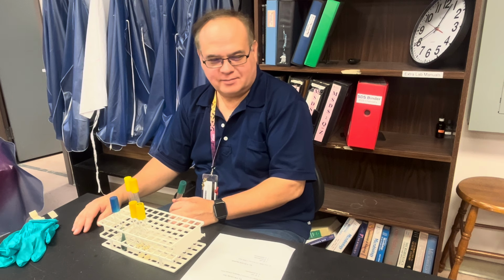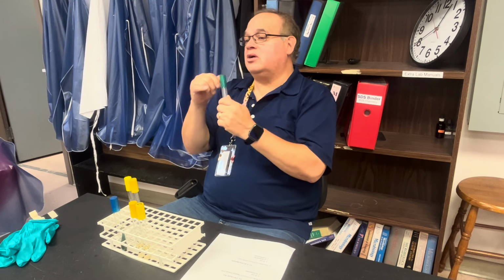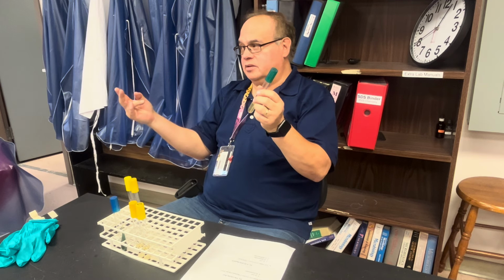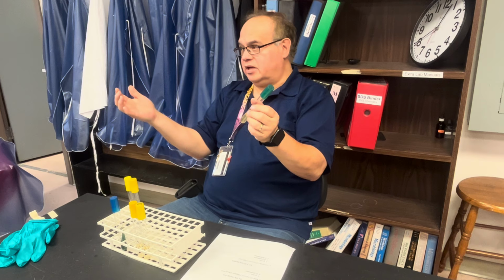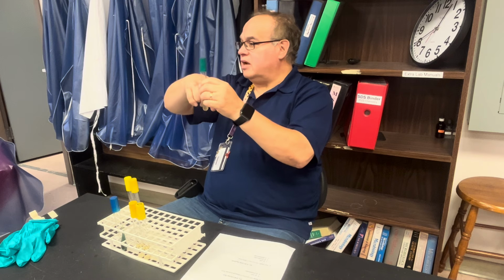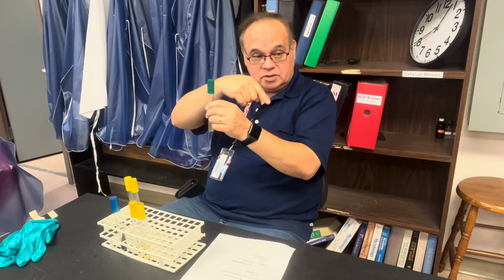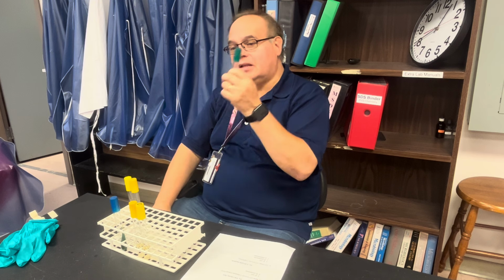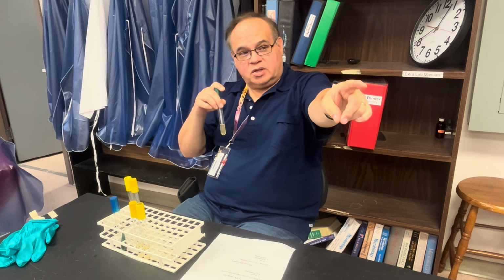You inoculate, you come back in 2 days, Thursday, and you can see those 2 things really quickly. If it's black, it's H2S positive. If it's not black, it's H2S negative. If it's only going to the site of inoculation, it's non-motile. If it's fuzzy away from the site of inoculation, it's motile. The last one is the reaction there.